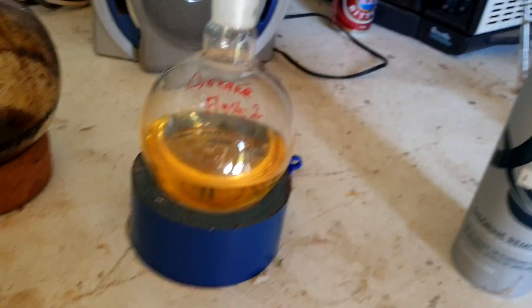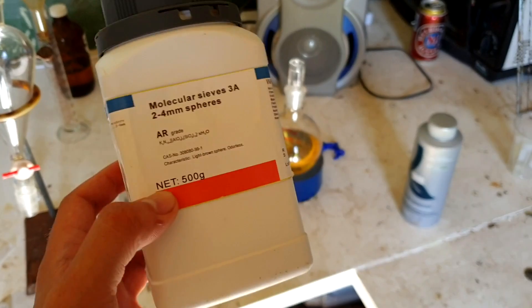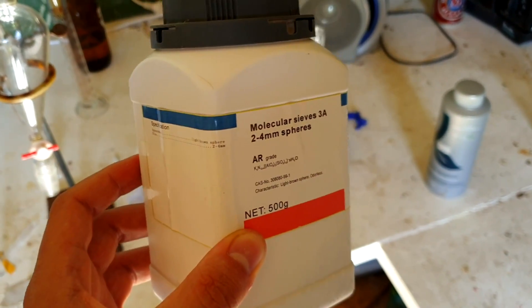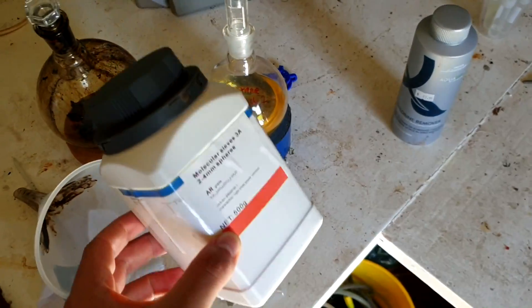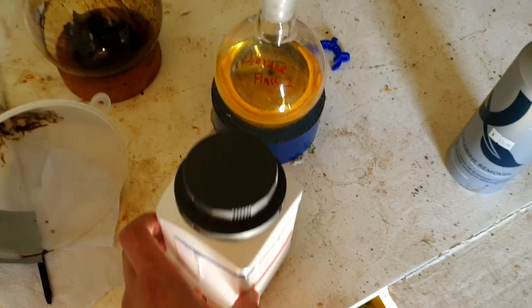All right, we've got our yellow dioxane. Now what we're going to do is chuck in a whole lot of molecular sieves, straight from the box. They're a little dusty straight from the box, but we don't actually care about dust for this because we're going to distill it later on.